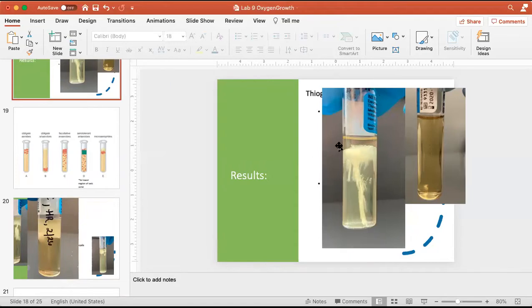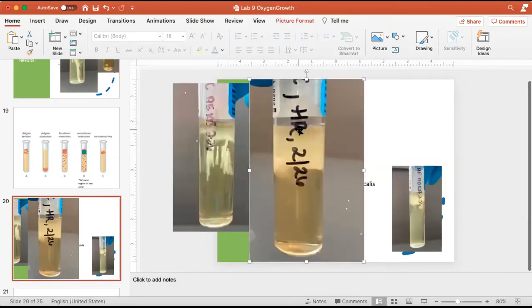This is our Enterococcus. And this one, of course, is only growing down at the bottom, so we can leave that one. But this one, yes, it is growing throughout the tube, but it's missing right here. If you compare that to this tube, this one is growing all the way through the oxic zone, and it's got some also hanging down into the lower parts of the tube.